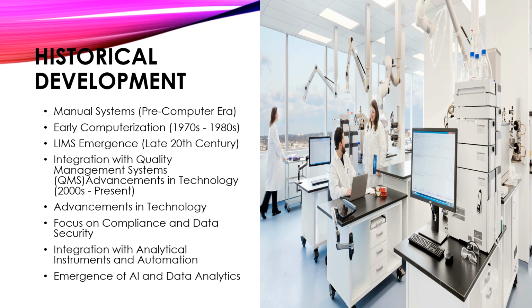Integration with quality management systems. As quality management became increasingly important in laboratory operations, laboratory information management systems started integrating with quality management systems to ensure adherence to regulatory standards such as ISO 17025, FDA, GLP (good laboratory practice), and GMP, good manufacturing practices. And this integration allowed laboratories to manage quality control processes, documentation, and compliance more effectively.